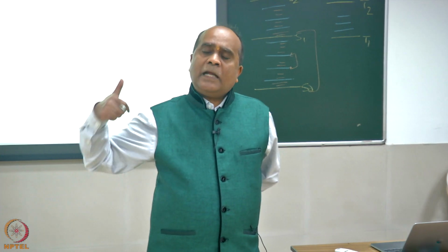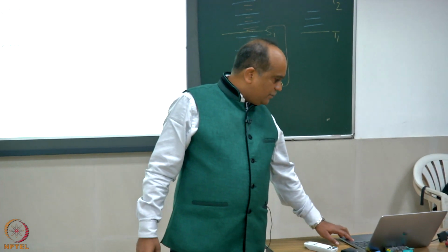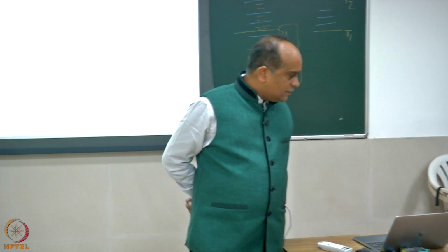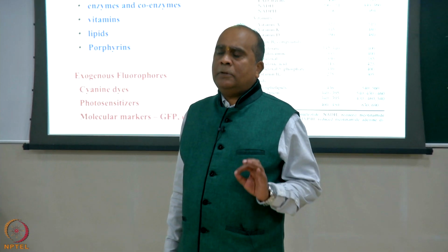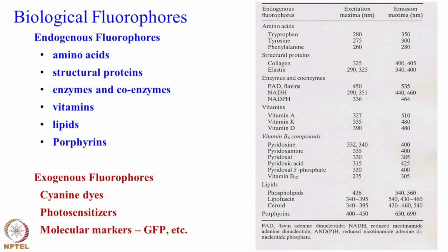So, FtsZ can be a target, the associated protein can be a target, all of these you can target using simple fluorescence spectroscopy. Extremely simple, but important and powerful technique for starting your drug discovery approach. It does not require too much money or too much time. You can develop a technique for fast screening, getting a potent drug molecule using fluorescence spectroscopy.